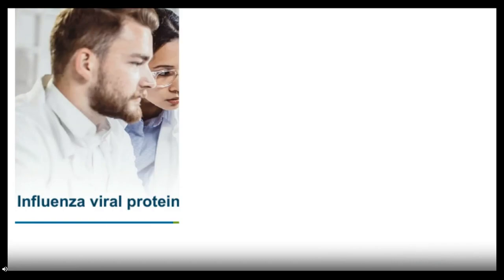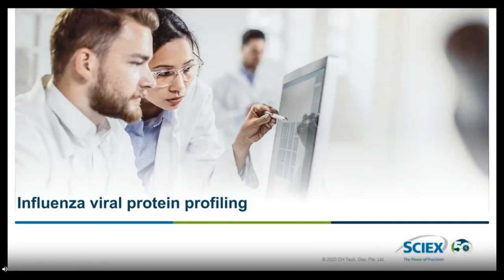So that gives you an overview of how this CE-SDS approach has been applied to protein profiling and also to viral protein profiling. But this presentation is about how it's been used particularly for influenza viral protein profiles. And I'd like to now pass you over to Patrick, who has developed this method in collaboration with SCIEX to actually use this approach in viral protein profiling. So over to you, Pat.